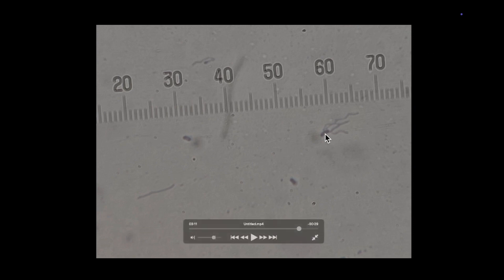You can see this bacteria with a tuft of Lophotrichous flagella. You can see some flagella here and also here.